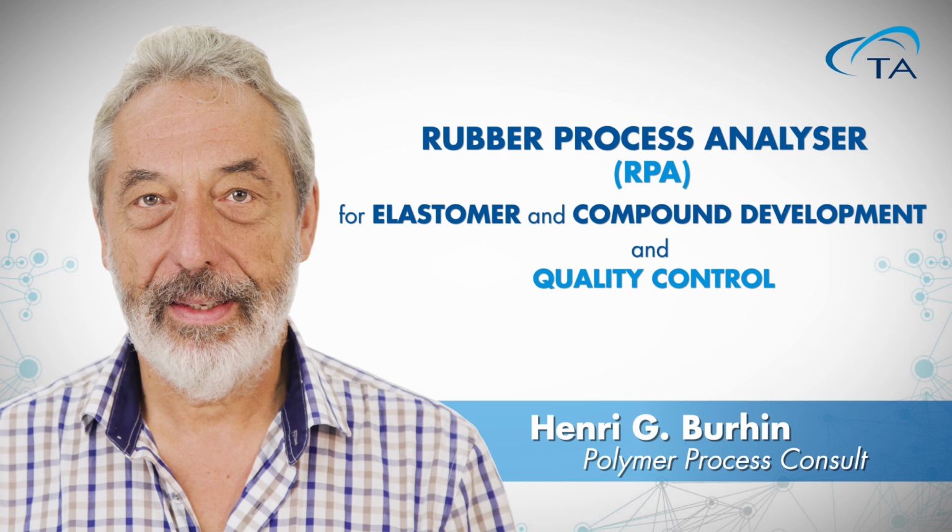Okay. All right, and we have time for just a couple more questions. This is a question about operation. How much training is required for running tests? Is it an easy system to use? 5 minutes. 5 minutes of training. I think that's very tractable for all of us. Yes, but I would like to comment. You asked the question, how long does it take for training to run a test? You didn't ask the question, how long does it take to understand the test results? Right. So that's different, of course. Clearly different requirements, and perhaps it's well suited for anyone to perform the tests as long as there's a good understanding for what to do with the data and how to understand the results afterwards.